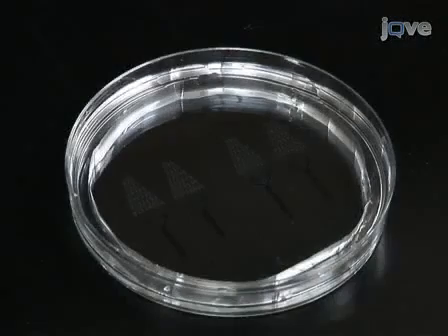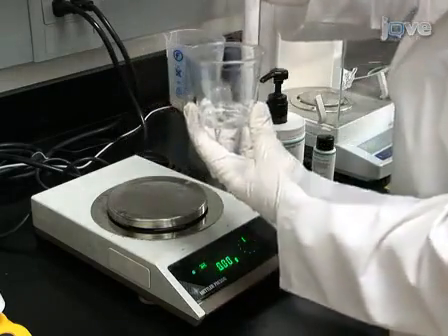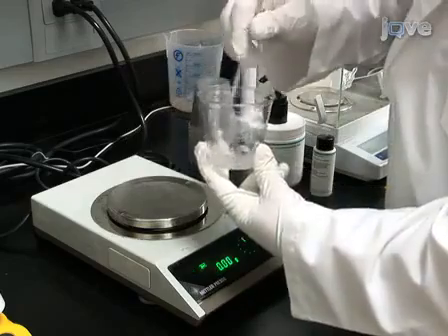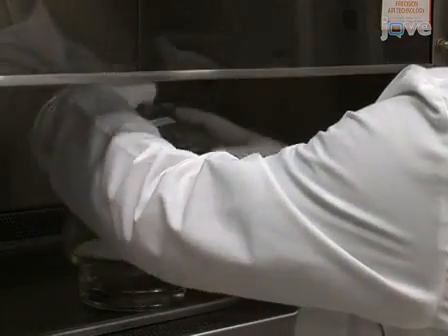The fluidic layer and the control layer are made by replica molding of polydimethylsiloxane, or PDMS, from the SU8 master. To begin this procedure, mix the PDMS prepolymer and crosslinker at a 10:1 weight ratio. Degas the mixture in a desiccator for 1 hour until air bubbles are removed.